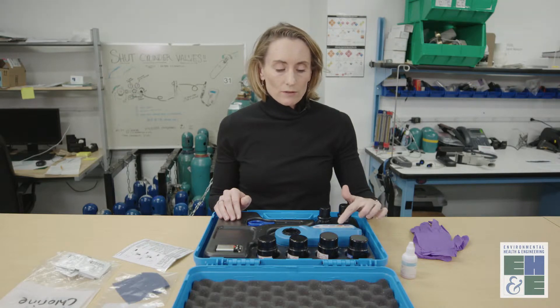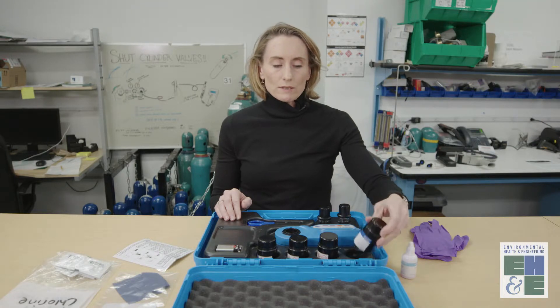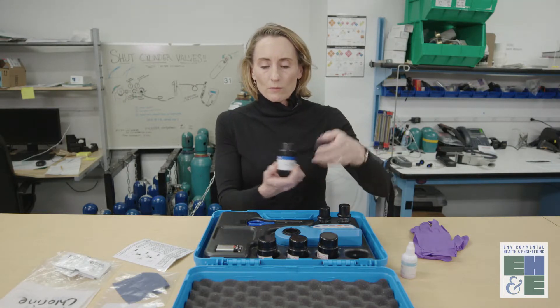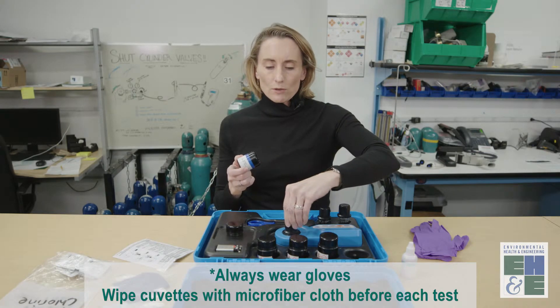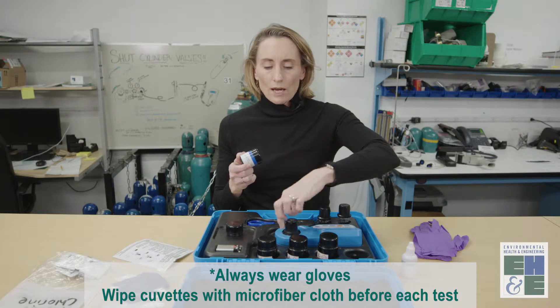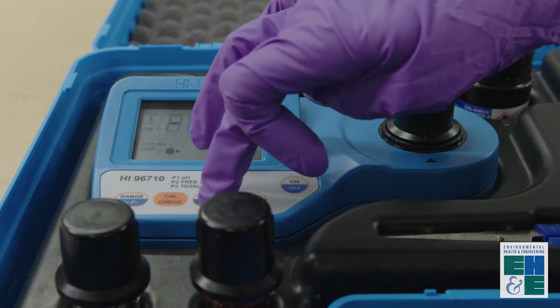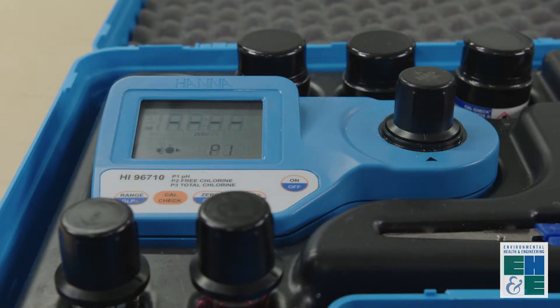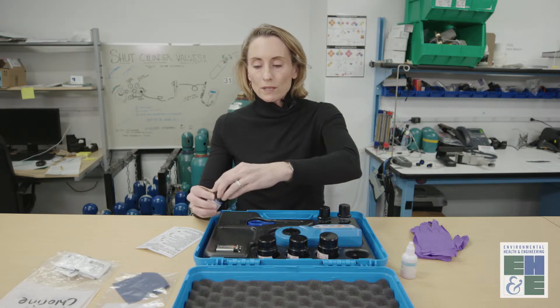First we're going to calibrate the instrument. You press the CalCheck button — the display reads zero — and you'll want to take the cuvette from the case that says zero and place it into the photometer. Turn it until the arrows line up and you feel a click. Now you hit zero with the zero calibration standard in the photometer. This displays 0.00, which means it's reading the zero pH accurately.